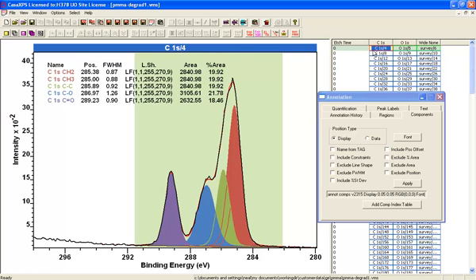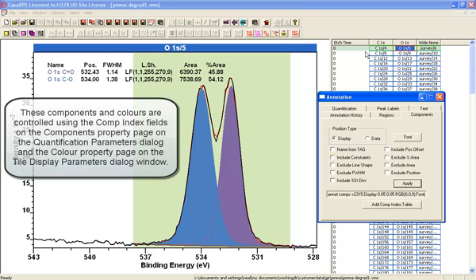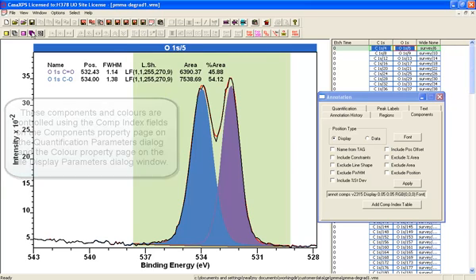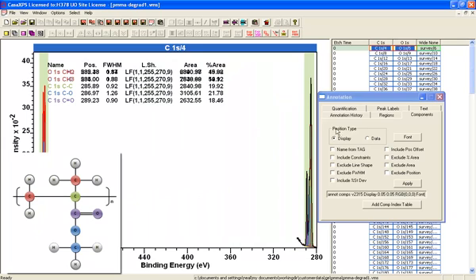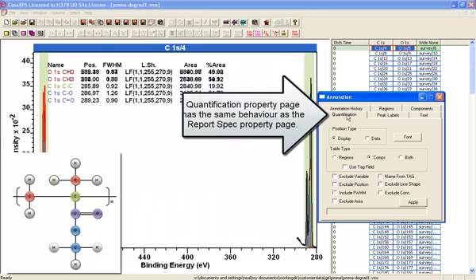If, on the other hand, we would like to see the relationship between the oxygen — which is currently displayed as a components table giving you the percent area — and we'd actually like to see the relationship between the carbon and the oxygen, then what we have to do is create a further table of type quantification.